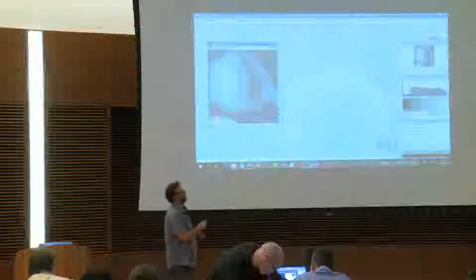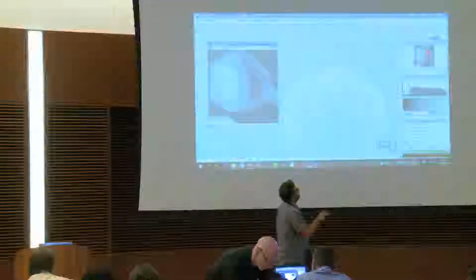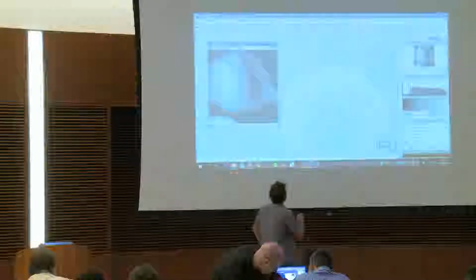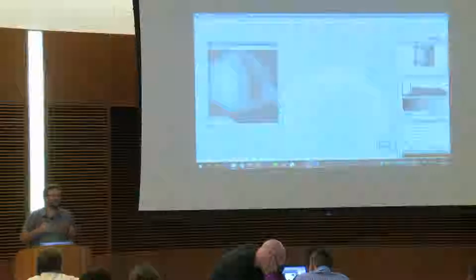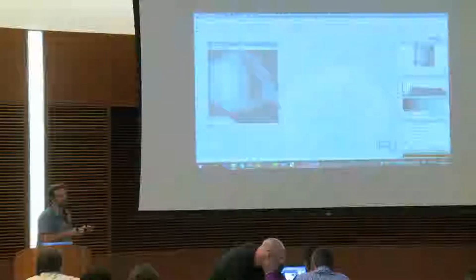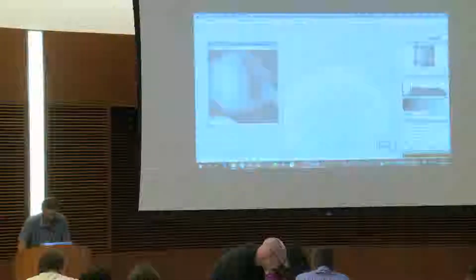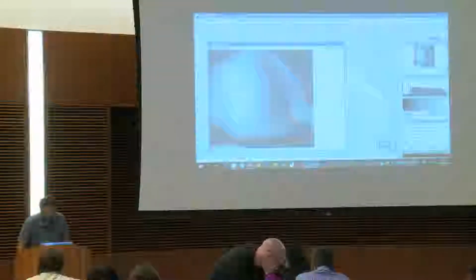So we have the image here, and here you have the navigation, and here you have the histogram. So my first question will be, can we have a close look at the background of the image to get some information? And you will see we will investigate on this image, it's quite funny. So here, I want to see this area.